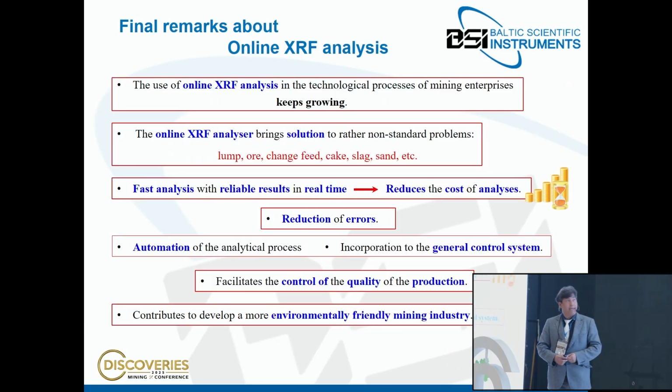For final remarks, I would like to mention that the use of online XRF analysis is growing among mining enterprises because it allows a solution for non-standard problems, due to the variety of materials it can analyze and the number of elements. The analysis is fast.